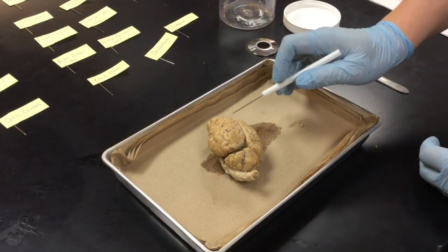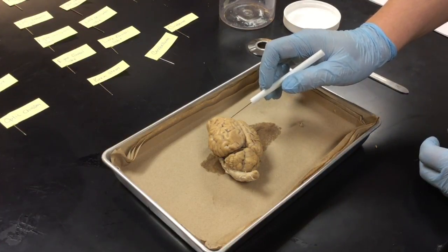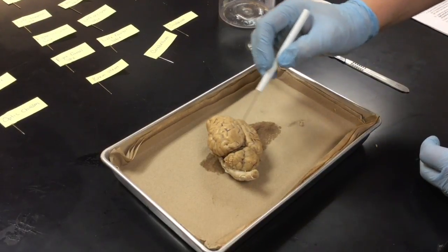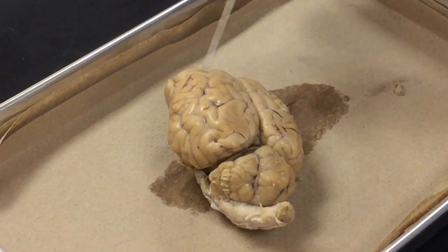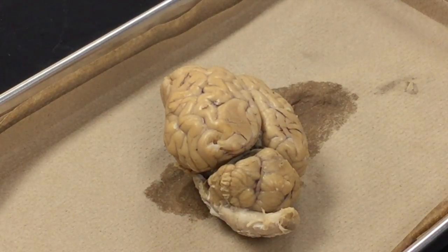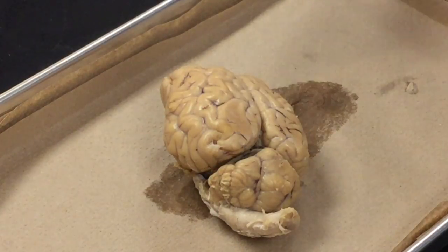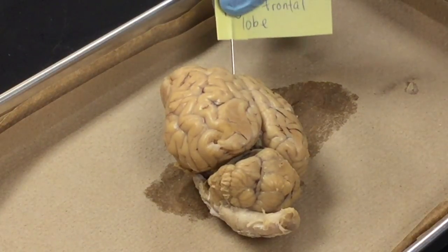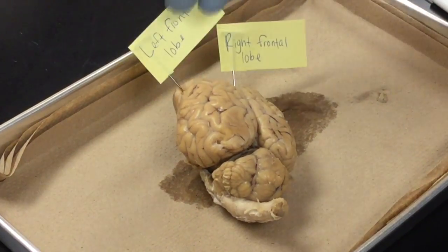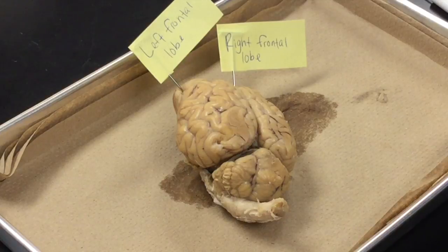Now if you look at your brain, you're going to notice that there is a section, a line that's running all the way down the middle, separating the cerebrum. Now this means that the left and the right side are going to be the exact same. So therefore, when we talk about the left and right, it's going to be from the frontal lobes facing the front. So therefore, this side would be the right frontal lobe, and this would be the left frontal lobe, located in the front region of the brain.